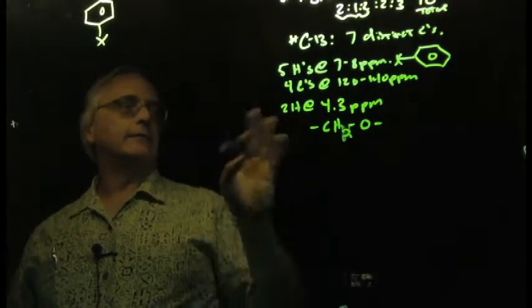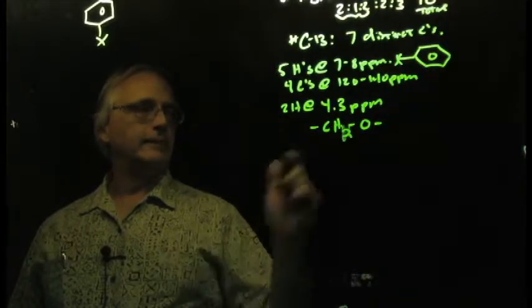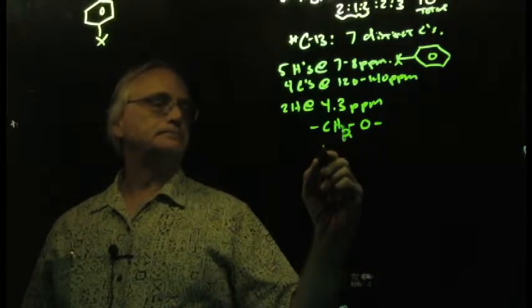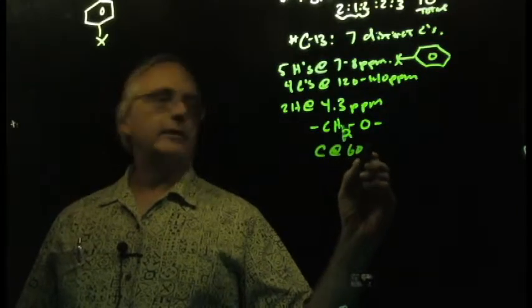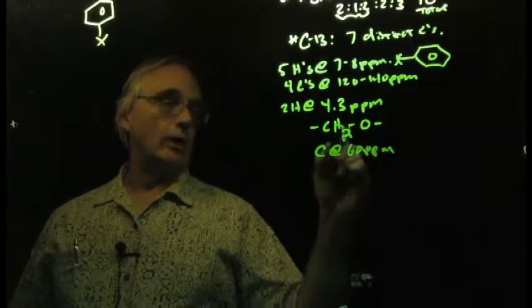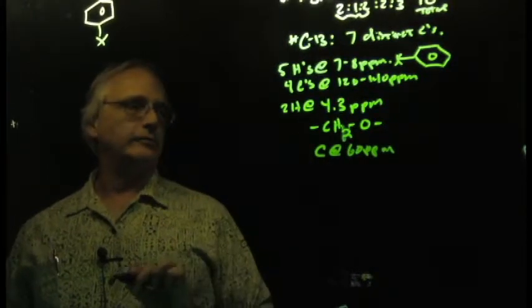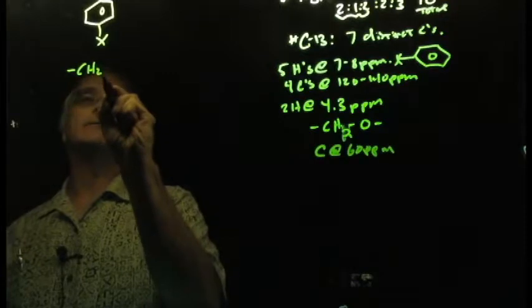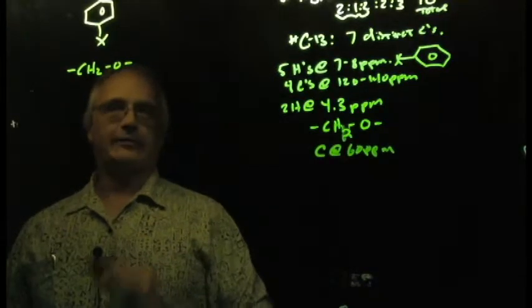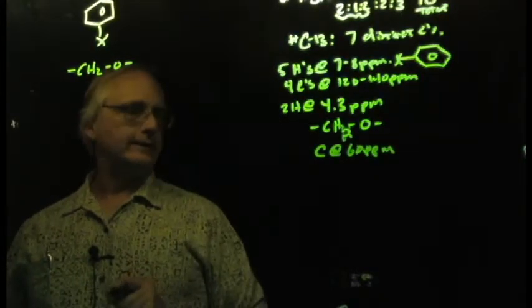Again, combining this information with the carbon spectra, I do see a carbon at about 60 ppm, which could well be that CH2 group. Okay? So I'm going to add to my collection of puzzle pieces that fragment here.